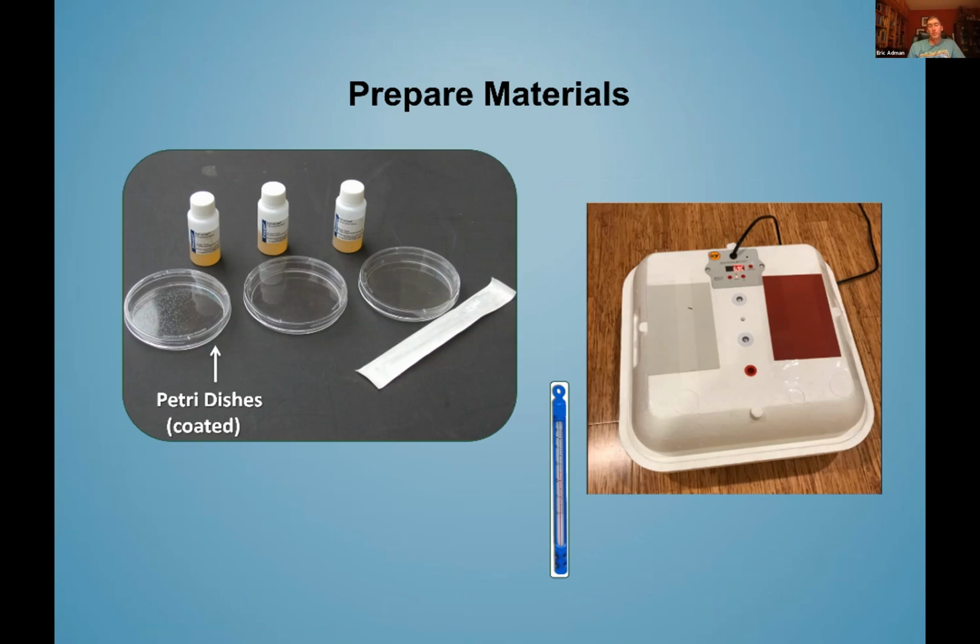They're just plastic dishes that have a bottom and a lid, and the bottom is coated with a particular coating that, when you put a water sample in there and let it sit for a period of time, typically about a couple hours, will gel, so it will harden up. The purpose of that is that if the sample stayed liquid, you would never be able to count the colonies. So it makes the colony grow in one place so that you can count the colonies.